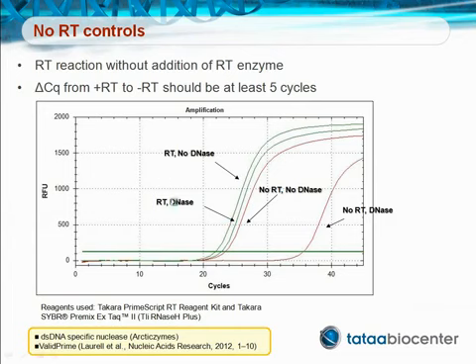So here are the RT positive signals and here are the RT negative. This is without treatment with nuclease. And if the difference is insufficient, the sample can be treated with double-strand specific nuclease, which will increase the difference between the RT positive and the RT negative control. Still another alternative is to use the recently developed ValidPrime protocol to measure and subtract the genomic DNA background signal.